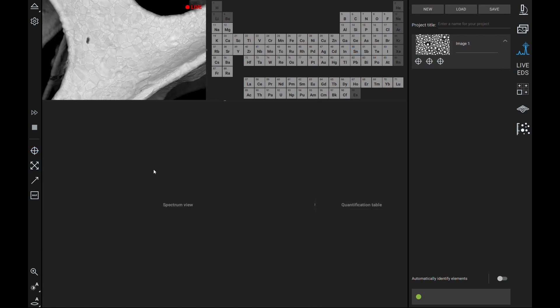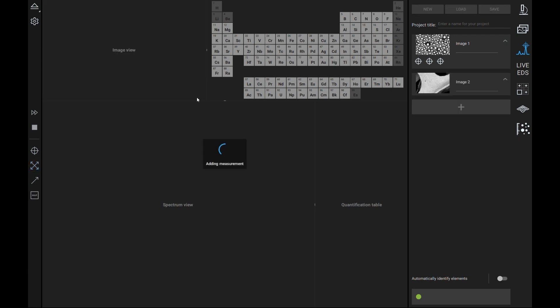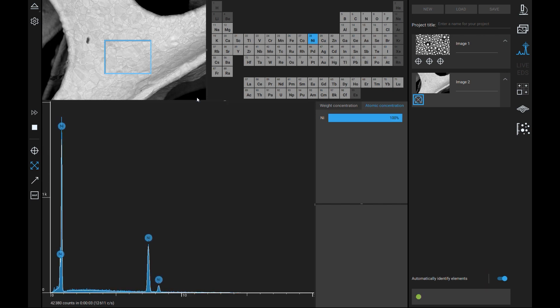EDS region analysis will calculate the total elemental makeup of a specified area in an image. Left click the box icon and left click and drag to define a region or simply left click to select the entire image to perform analysis. This feature is excellent for bulk elemental calculations of a specified area.